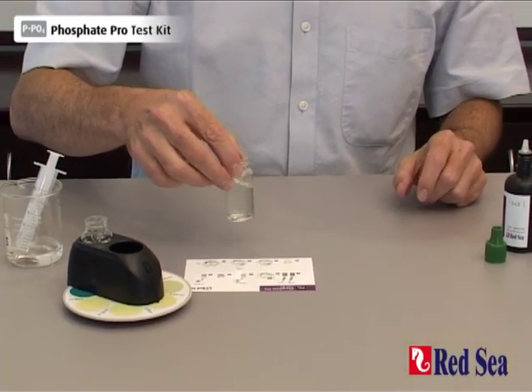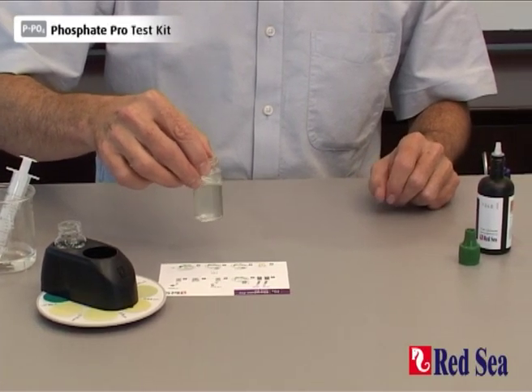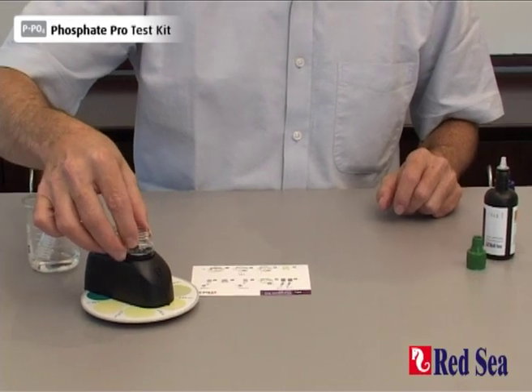Again, shake the vial to ensure good mixing, and we're going to place the reaction vial into the center of the comparator.